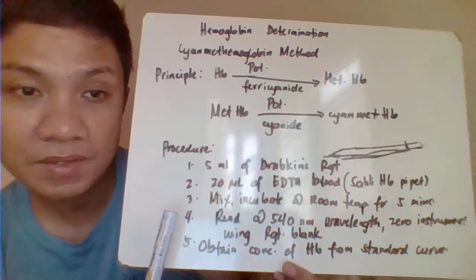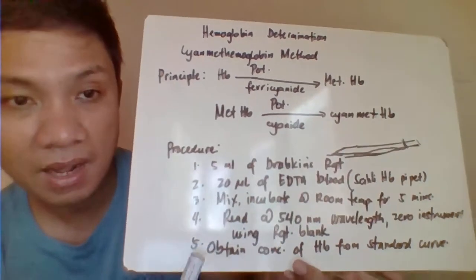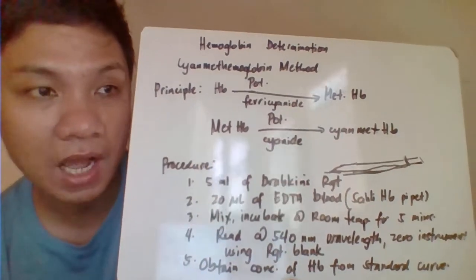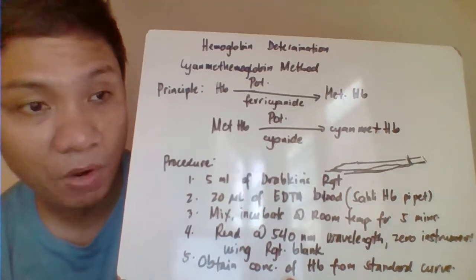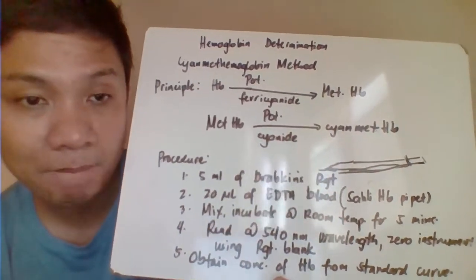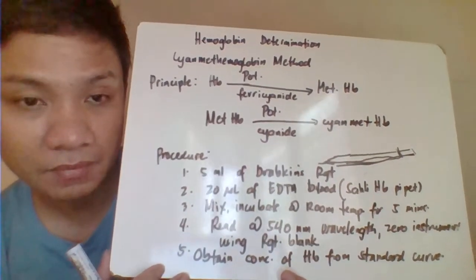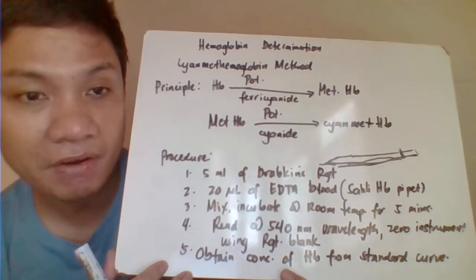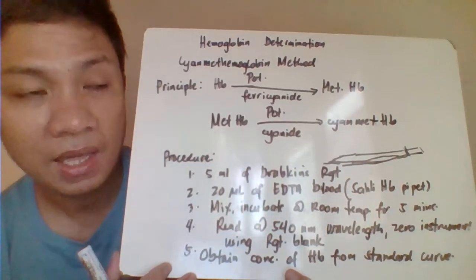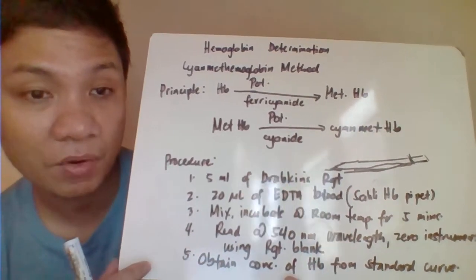You set your spectrophotometer at 540 nanometer wavelength, and then measure the absorbance of your hemoglobin sample. But then you need to make your standard curve for your hemoglobin, and from that standard curve, you derive your hemoglobin concentration.